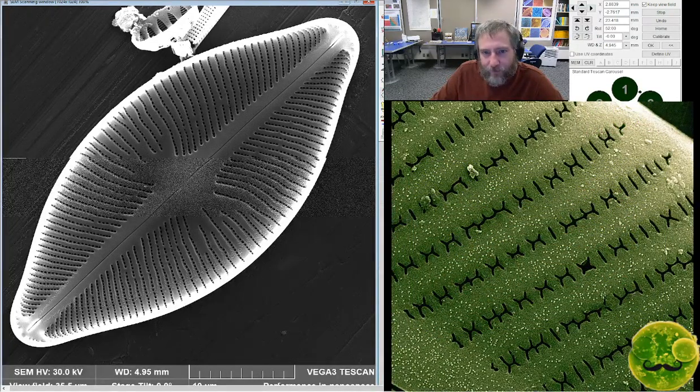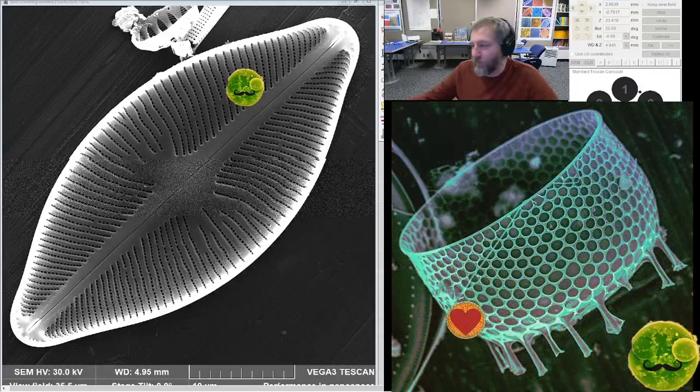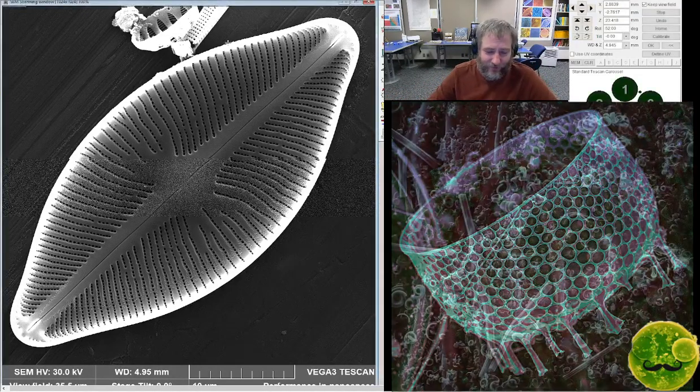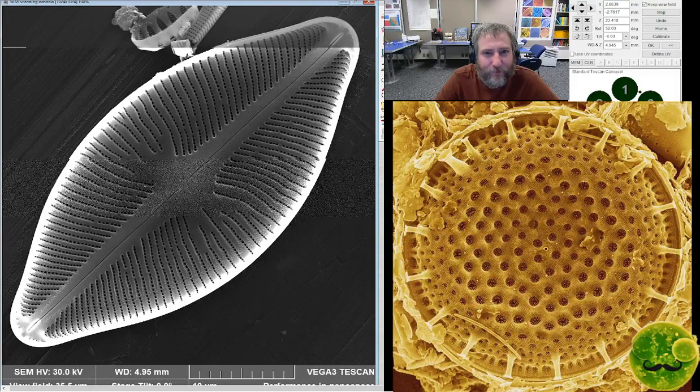So this is a little overbright. It's sort of glowing around the outside edges, so I'm going to try to balance it a bit, and then we'll take a picture. I don't know the name of this Sellaphora off the top of my head. I was going to bring in the little African taxonomy book so I could look through it while I was taking pictures, but when I'm streaming, I really can't keep up with looking through a book for taxonomy. It takes hours sometimes to find the diatom that I want. Usually I can do it in a couple of minutes, but to be sure what you're looking at would require some pretty serious effort.